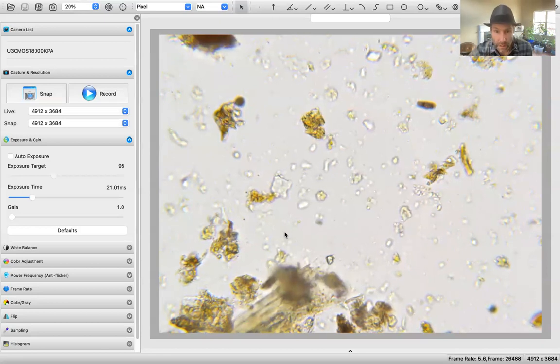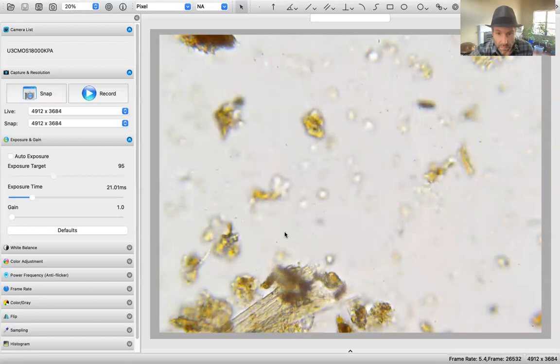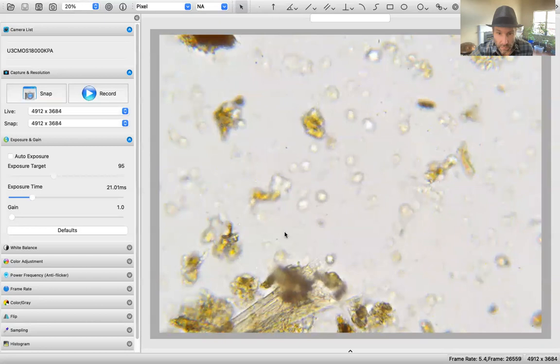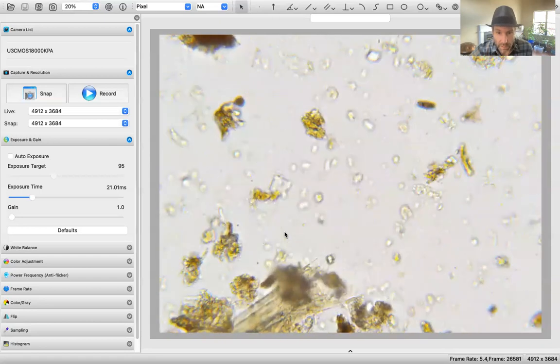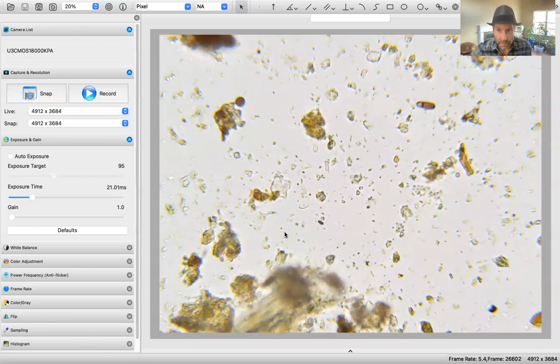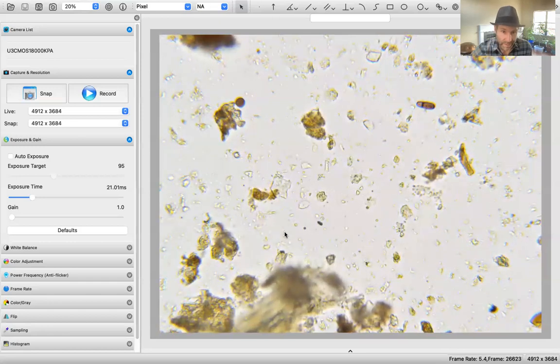Let's go ahead and go to the top of the column. No flagellates seen, and no fungi coming out of the organic matter that I can notice. And my assessments to date have been accurate as far as my mentor has expressed, with the exception of my time.